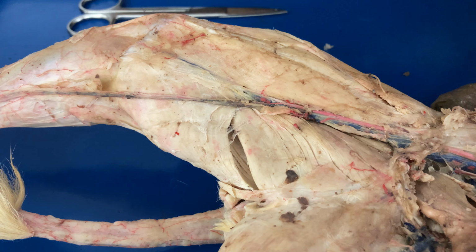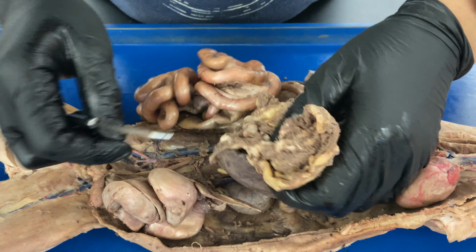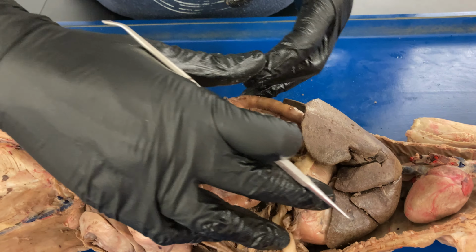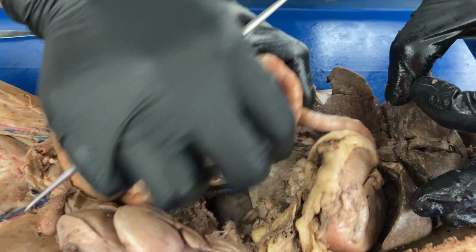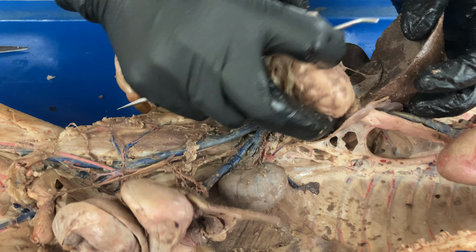Okay. One structure that I want to show you, and it's not too clear to see, is the hepatic portal system. Now remember, when the mesenteric arteries bring blood to the small intestine, it picks up the nutrients, and it's going to work its way up to the liver, and I don't think you can see it here.